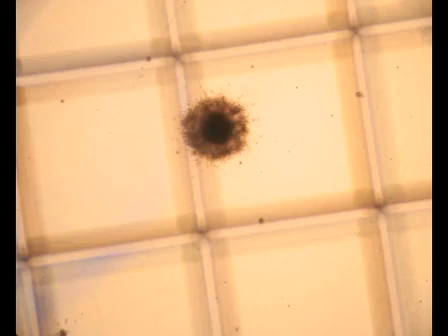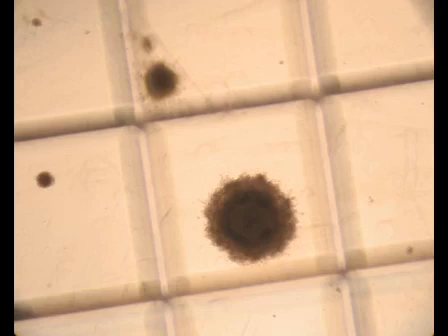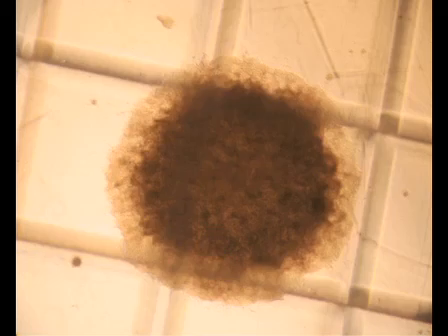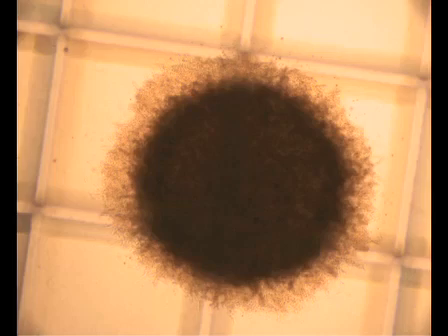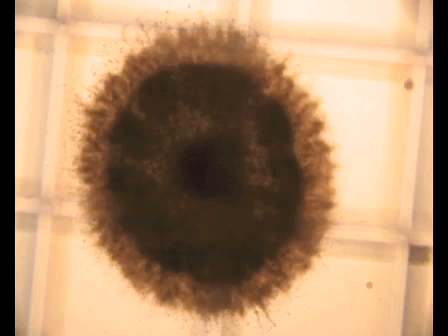After 3 weeks, colonies can be classified into two major categories: those less than 2 mm in diameter, which are progenitor cell-derived, and those greater than or equal to 2 mm in diameter, which are stem cell-derived. The colonies that are greater than or equal to 2 mm in diameter fulfill all the functional criteria of a bona fide neural stem cell.